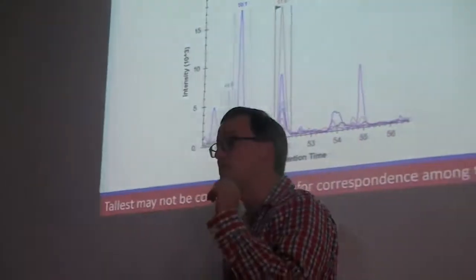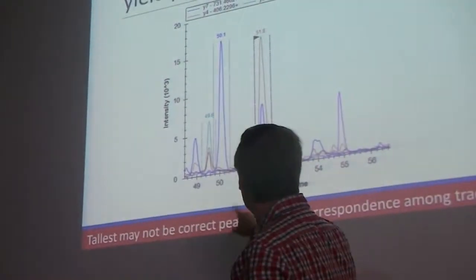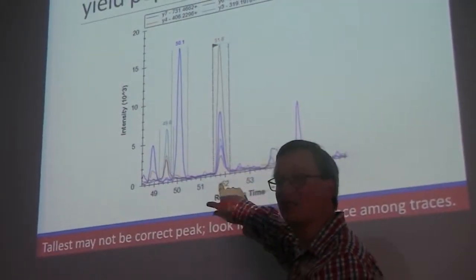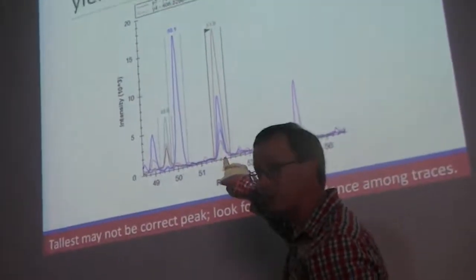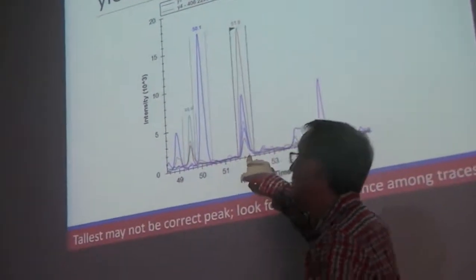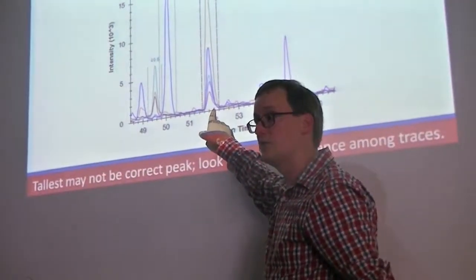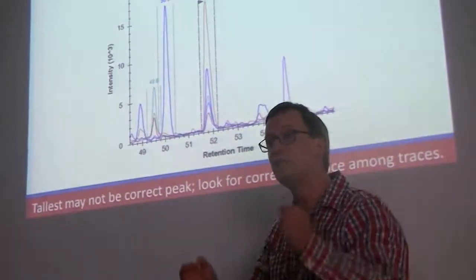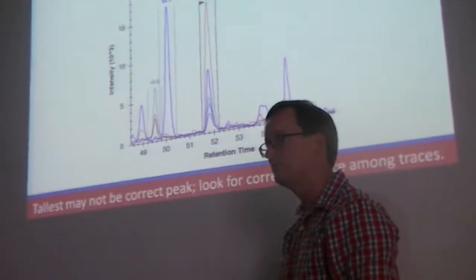So the fact that we're monitoring multiple fragments for this peptide helps us to realize that this, even though it is not the most intense signal for the dark blue trace, is the correct one, because this is where all 5 of those traces rise and fall in concert. So this is the value for us in measuring multiple fragments for an individual peptide precursor.